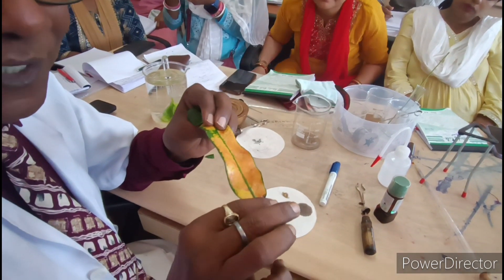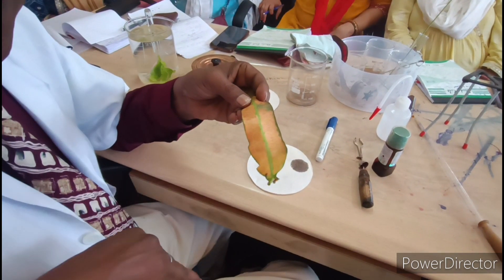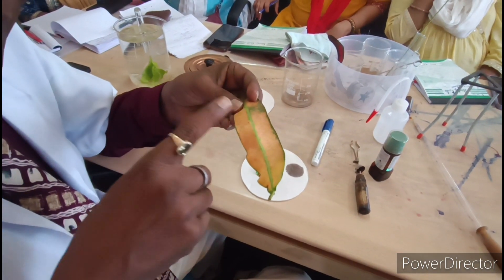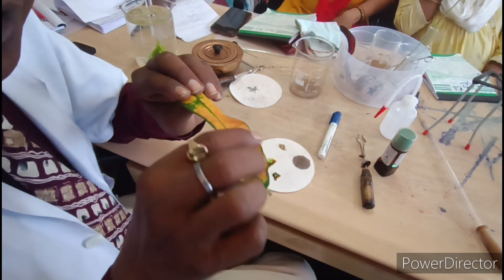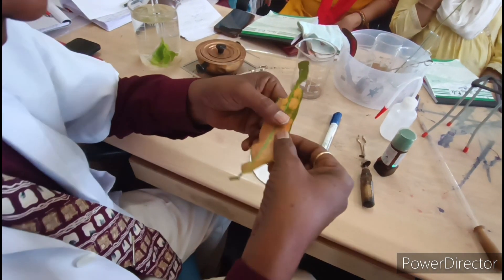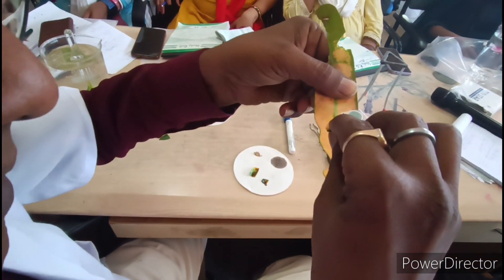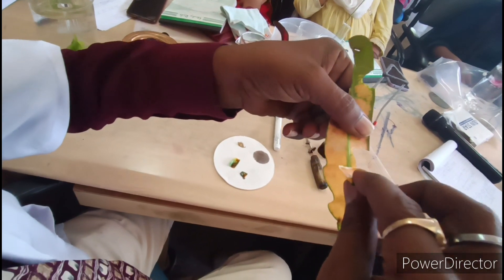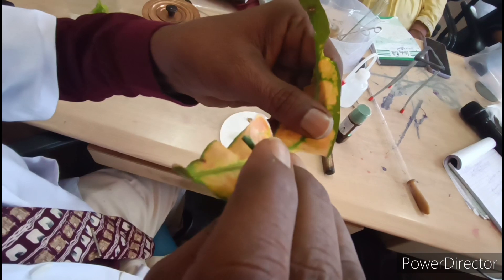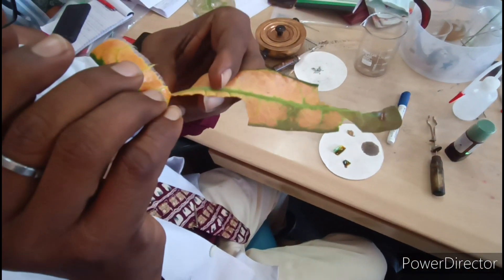This is the dorsal side, which will face the sun, and this is the ventral side, which is the opposite side — facing the ground. Whenever we have to observe stomata, we have to peel from the ventral side, because the dorsal side has a thick cuticle and very few stomata. We have to peel the ventral side — it has a transparent layer.